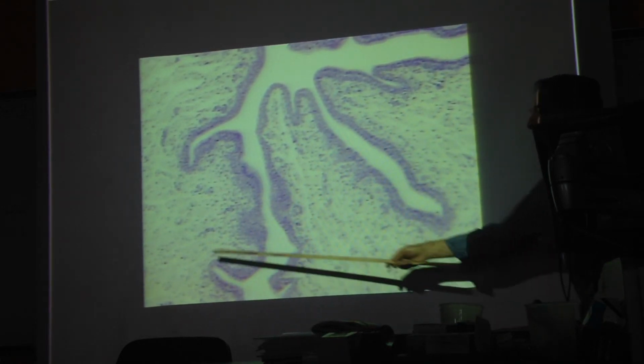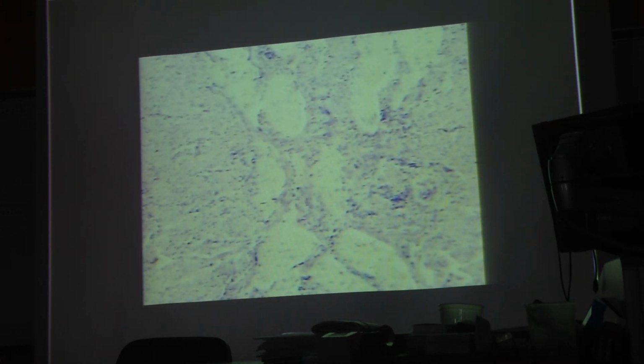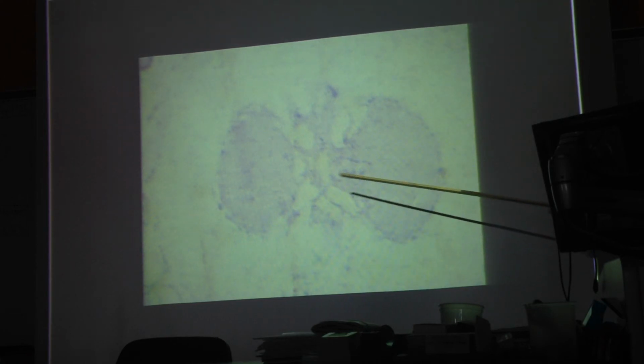Surrounding the urethra, all this stuff, corpus spongiosum, one of the columns of erectile tissue. The other two lie dorsal to the urethra. They're not very well developed here because it's an immature penis, but you can see they're sort of mirror images of one another. There's one right there. There's another one over here. In the shape of a bean. And what are these? What do you call these columns of erectile tissue? The corpora cavernosa. Corpora cavernosa.